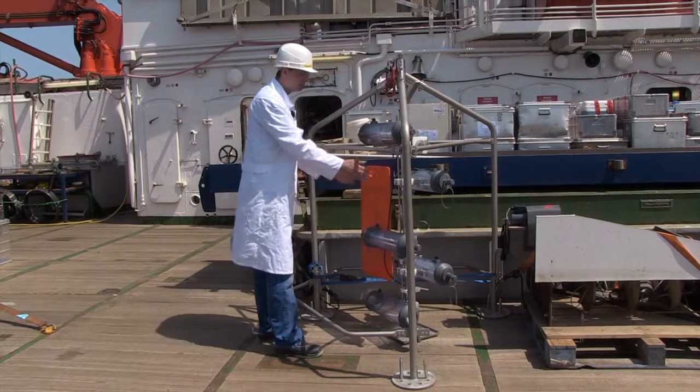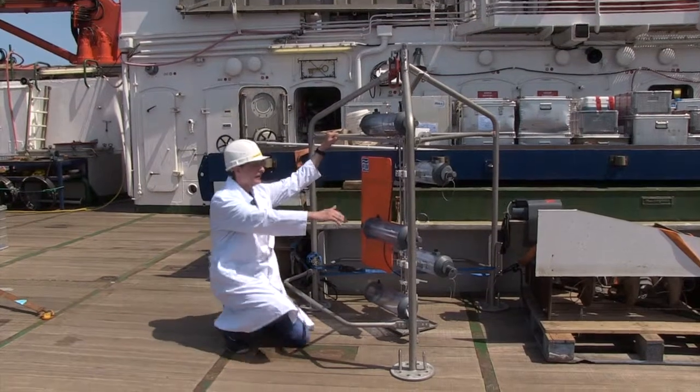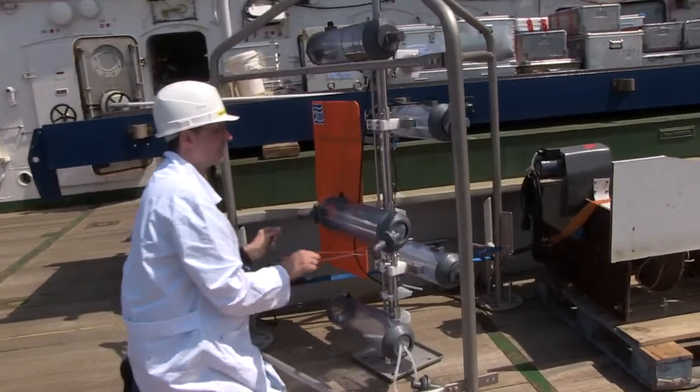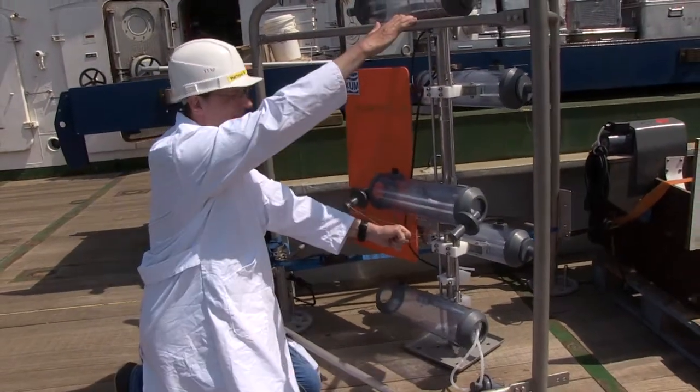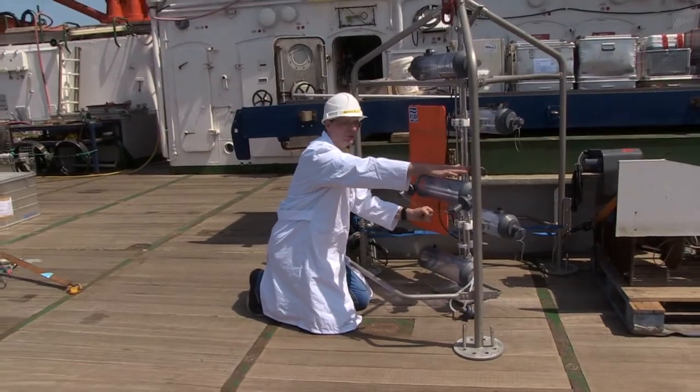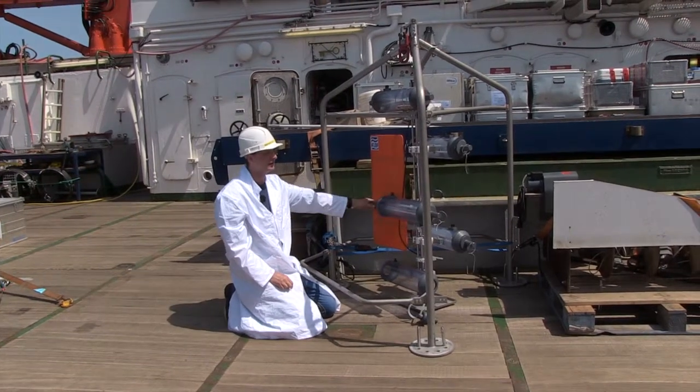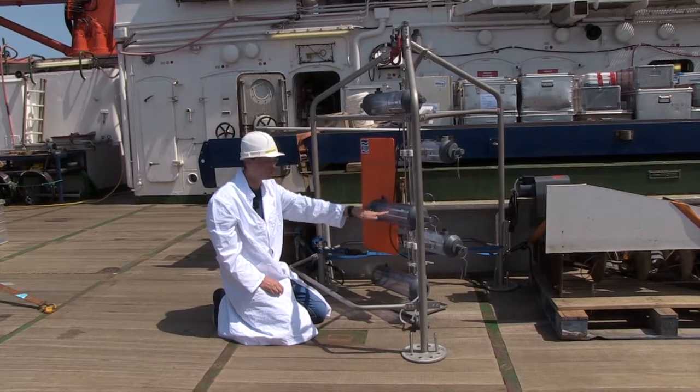The bottom water sampler has five Niskin bottles, arranged in parallel at different levels, which are first opened and then remain cocked and ready. As soon as the bottom water sampler rests gently on the seabed, the lids of the Niskin bottles close and seal the water from the seabed in the bottles.